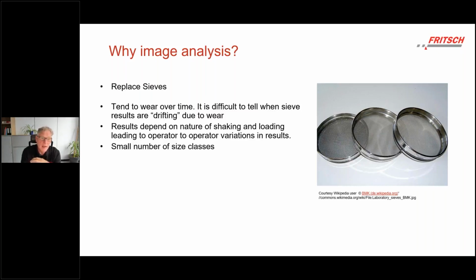And you also find that it pretty much depends on the user who is using this machine, because you may vary the duration, you may vary the amount of material put on the sieve, you may add different additives. Of course you can standardize all these factors and set up a solid method, but nevertheless you have significant difficulties in the reliability of the results themselves. So reproducibility, from my experience, is not that good using sieve shakers.